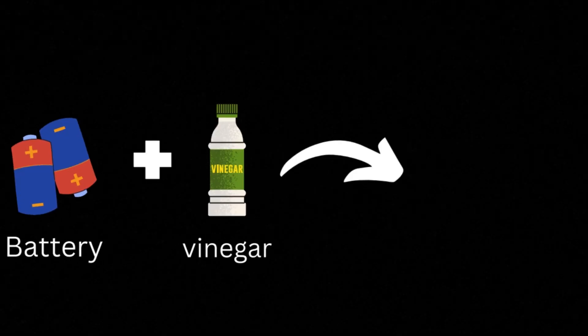Today in this video we are converting zinc battery and vinegar into zinc oxide.